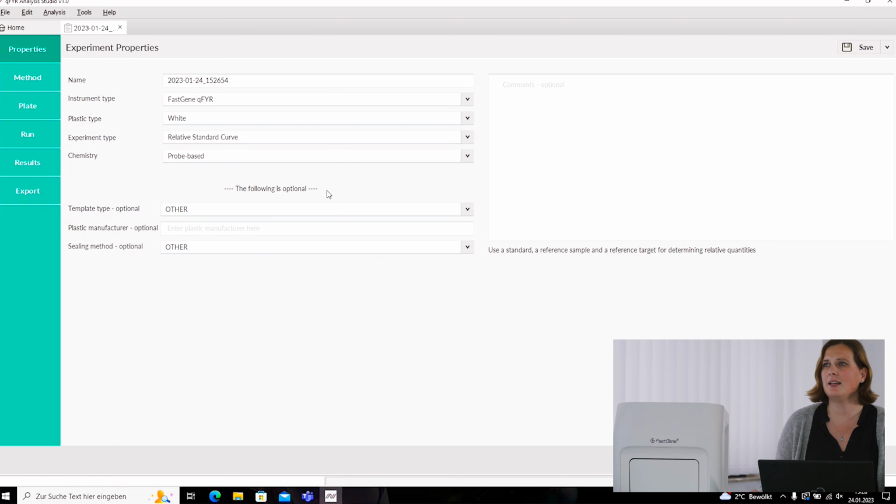For example, in a study of drug effects on gene expression, an untreated control would be an appropriate reference sample. For all experimental samples, target quantity is determined by interpolating from a standard curve and then dividing by the target quantity of the reference. The reference then becomes the 1x sample and all other quantities are expressed as an n-fold difference relative to the reference.